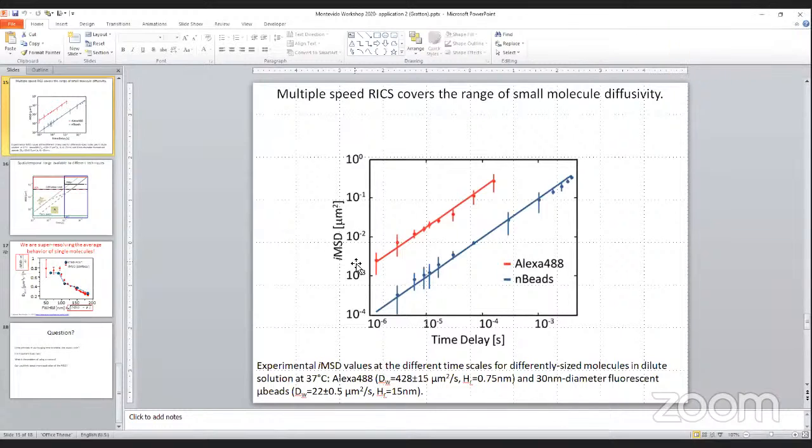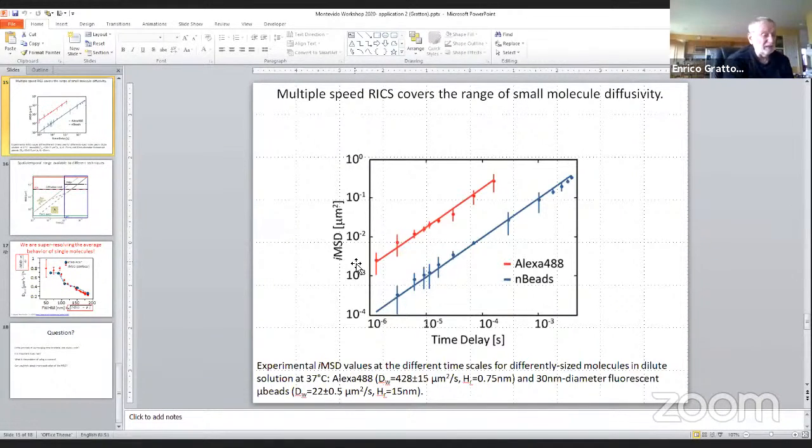Yeah. What I was thinking was, I remember when we wrote the paper for the comparison between pair correlation and IMSD, and you asked me to make a plot, which was, if you have something that is moving fast, either you have to scan fast or record as fast as you can, or you have to go as far as you need in order to catch the diffusion. So the speed. And this is what I said, with the camera which has 500 pixels, you cannot catch it. You never reach that. It's the same question, just in a different way.